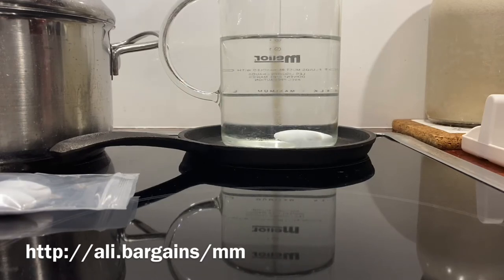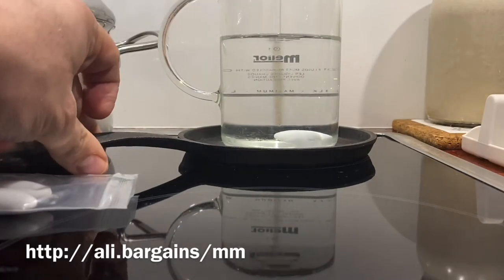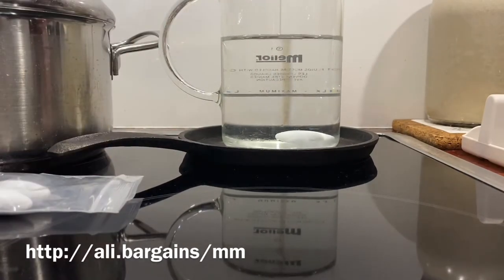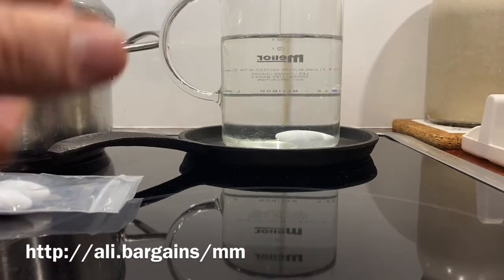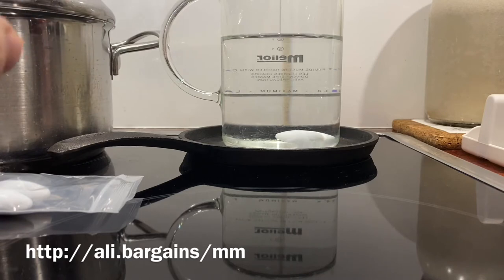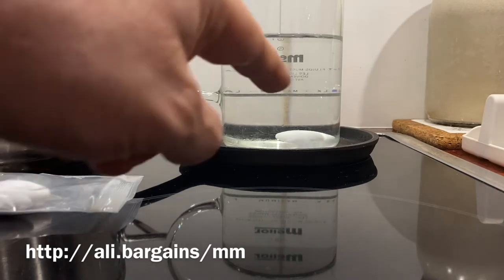So I guess the magnet in there is stuck to this cast-iron pan, but without this we won't have any heating because the glass itself of course will not interact with the induction, maybe the magnet itself.